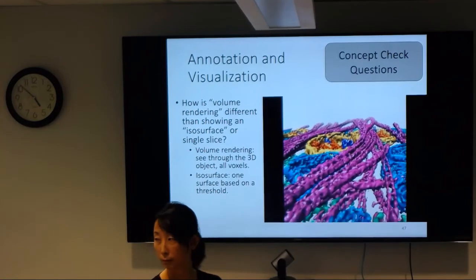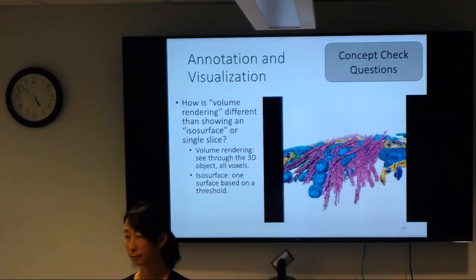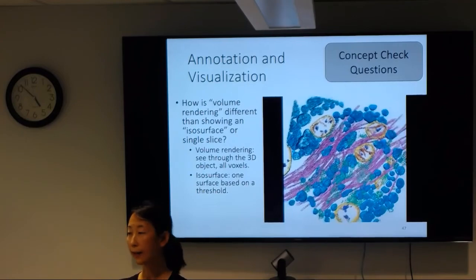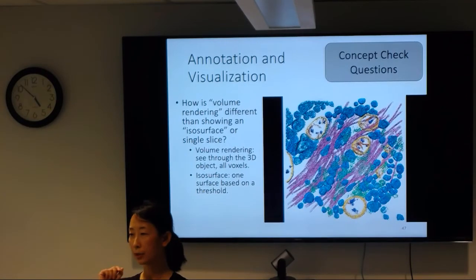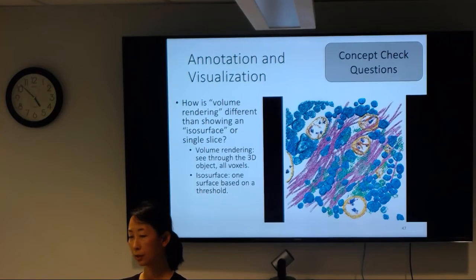So how does it identify the isosurfaces? Is it the density or the value of the voxels, or is it connectivity? You can think of it like in 2D. If you have a map, basically 3 by 3, with values 1, 1, 2, 2, 3, for example, and you set a threshold of 2, any square with a value smaller than 2 is going to be 0. Then you draw a line along 2. That's an isosurface. It's called an isoline in 2D. The same idea applies in 3D.